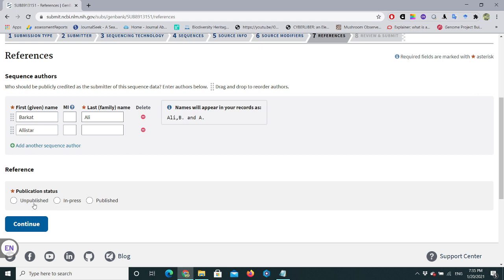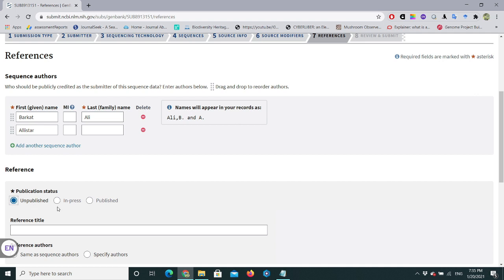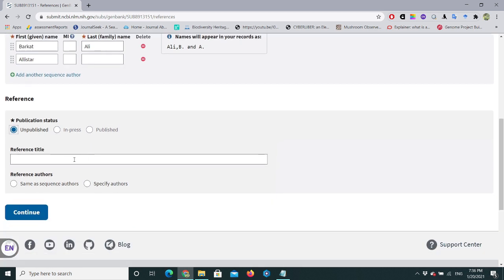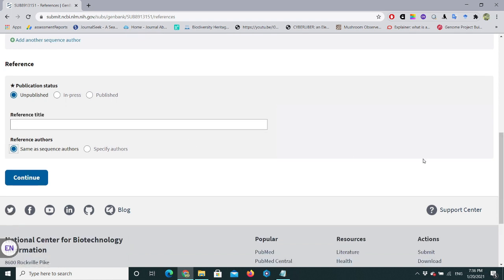For Publication Status: if unpublished, select 'Unpublish'; if your article is already published, select that option; if it is in the pipeline under processing, select 'In press'. For Reference Title, you can select 'Same as sequence authors'. The reference title is what will appear in your NCBI sequence record under References — showing who submitted these sequences. You can also specify separate authors for the article. Click Continue.